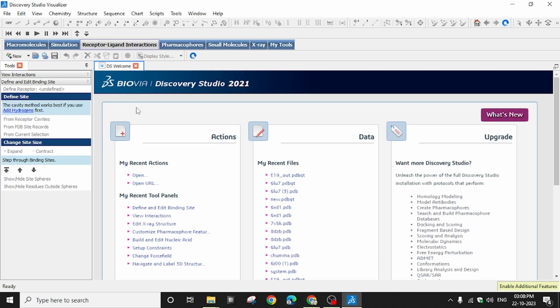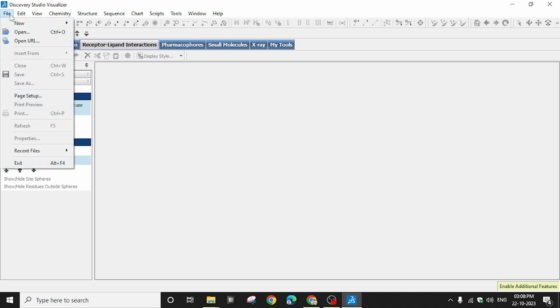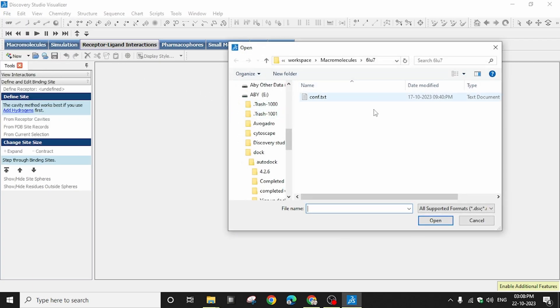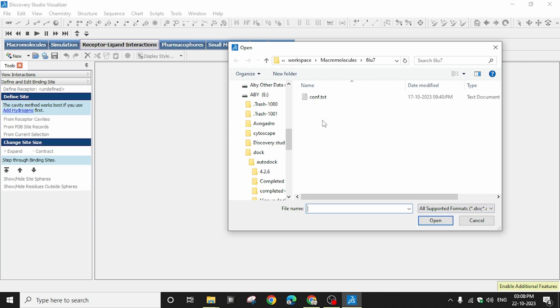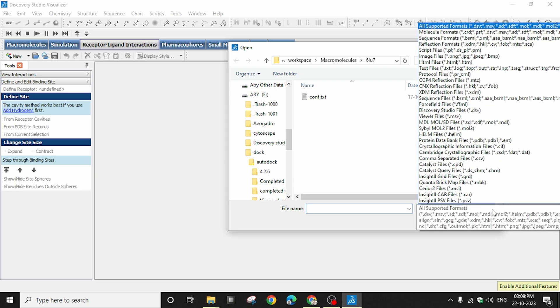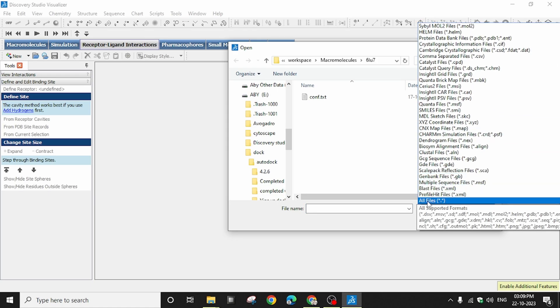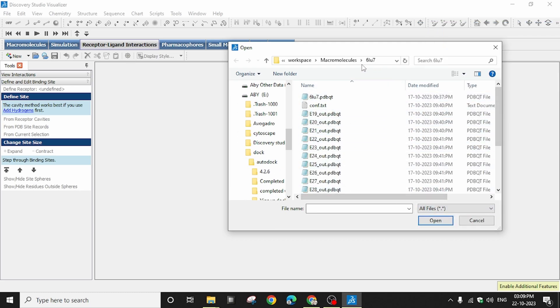In Discovery Studio, I'll first open my protein PDBQT file. Click File > Open. My file is in the workspace, default folder, macromolecule 6LU7. You'll notice under 'All Supported Formats' only certain formats are listed — .dsv, .msv, .sd, .sdf, etc. — but there is no PDBQT. To open a PDBQT file you need to click the format dropdown icon and drag all the way to the bottom to select 'All Files.'